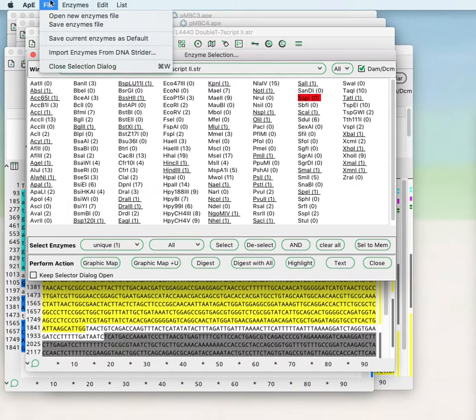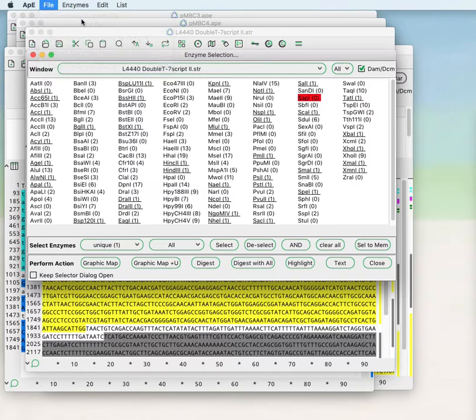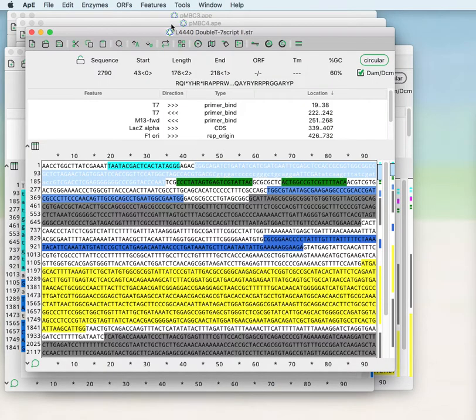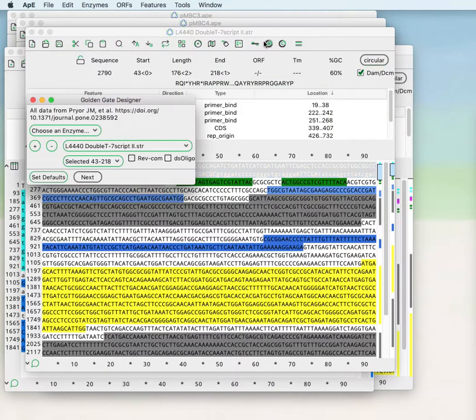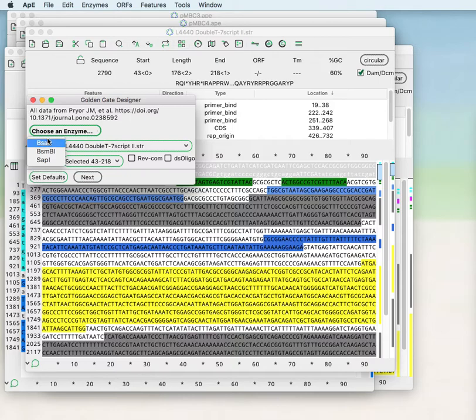You can then do file save current enzymes as default and those will be saved for the next time that you open APE. But in this case we already have several enzymes available to us.